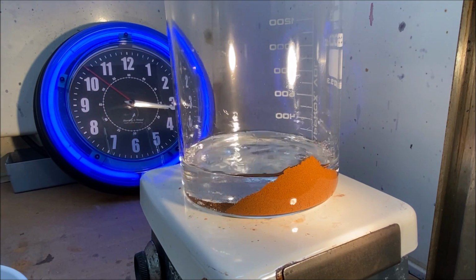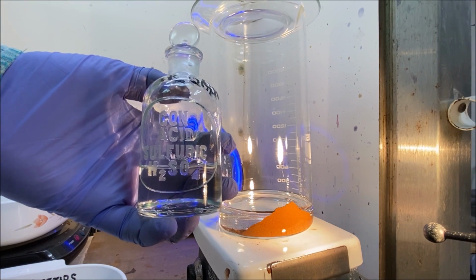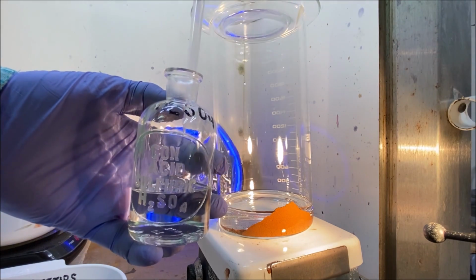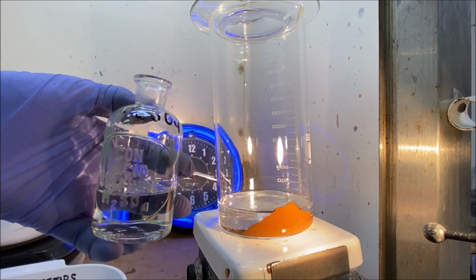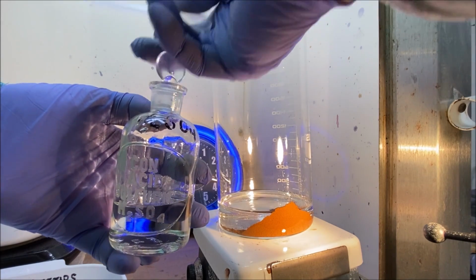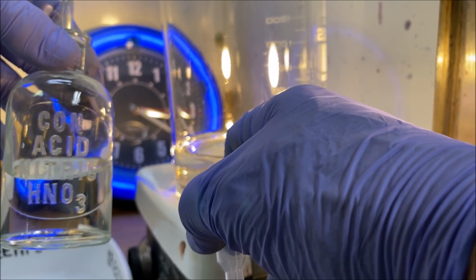That's a little over 200 milliliters of hydrochloric acid. As usual, we'll add a few drops of sulfuric acid to precipitate out any lead. If there's lead in here, which there shouldn't be, the lead will combine with the sulfuric acid, forming lead sulfate, and then we can filter it out 100%. We've got the gold, hydrochloric acid, and a little bit of sulfuric acid in here.